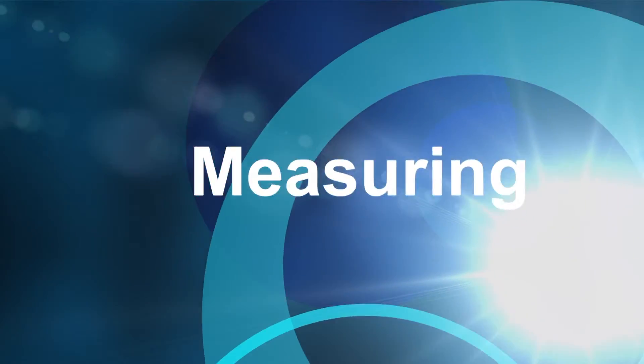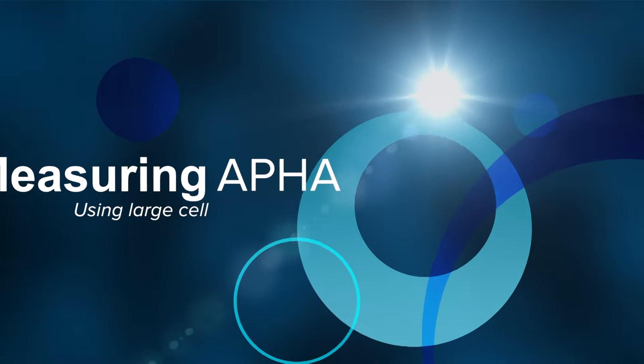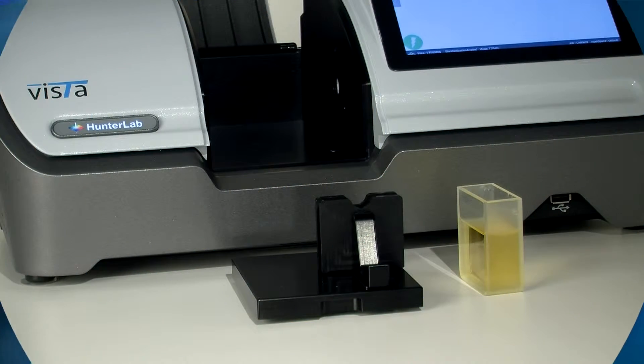This video demonstrates how to measure APHA using the Self-Centering Large Cell Holder Base Plate. Make sure the instrument has been standardized using distilled water in the same size and type cell used for your samples.